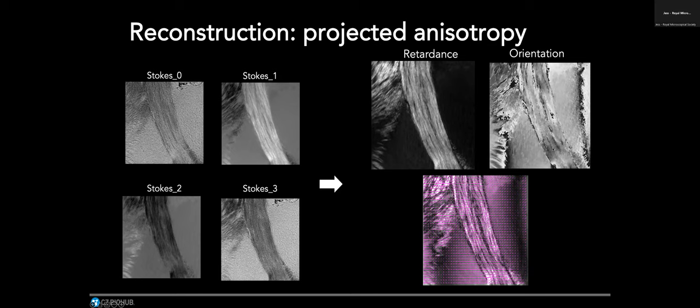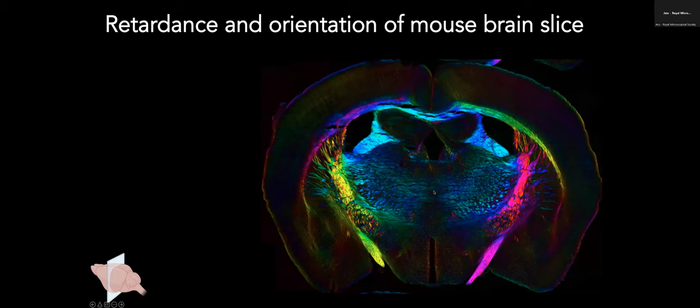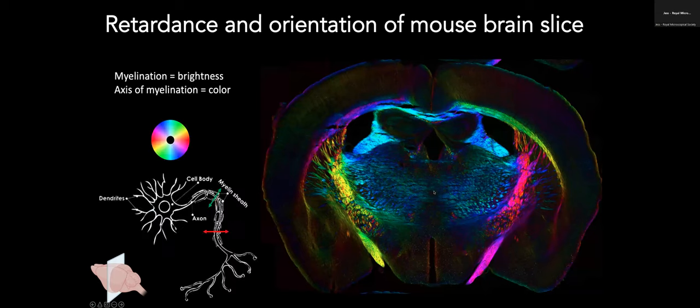Here I'm showing the orientation by line, and you can see that the orientation along which the material is dense is perpendicular to these fibers. The reason is that in brain, the primary source of anisotropy is the myelin sheath.